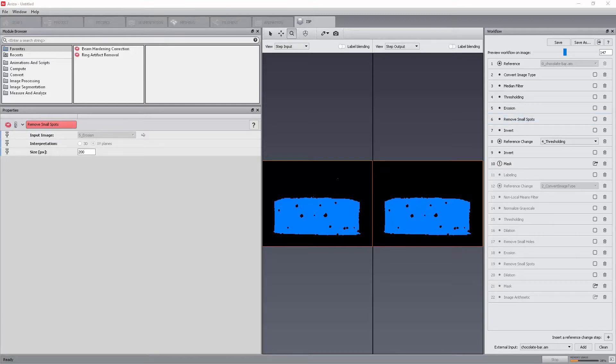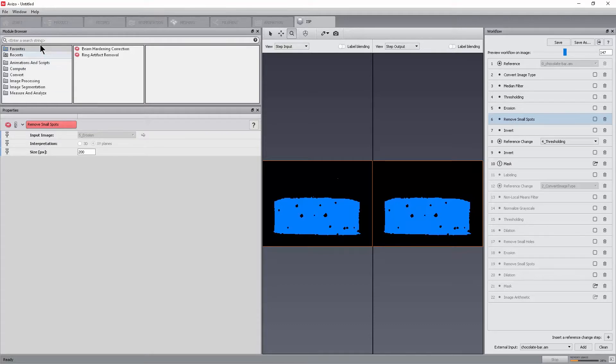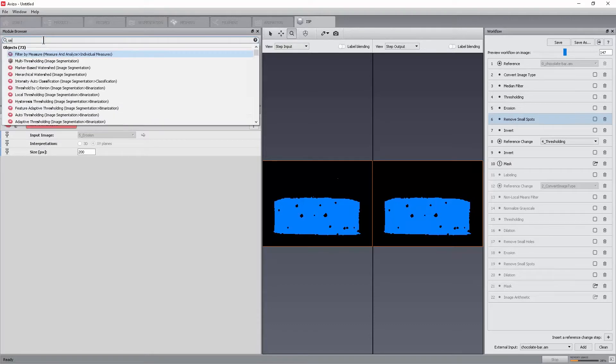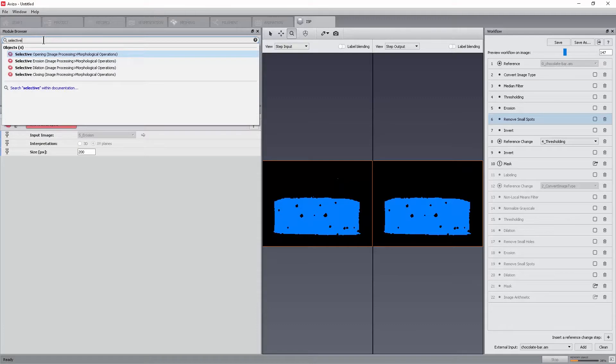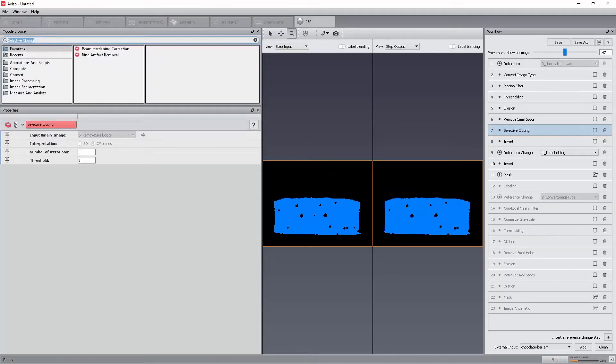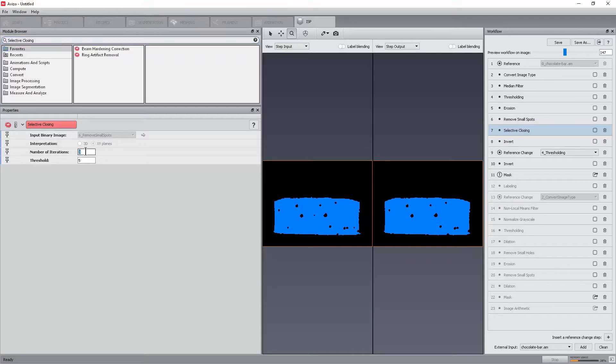The workroom does not delete every step. There is still a chance to fix this by simply re-editing the workflow. Select step 6, remove small spots, and type selective in the quick search toolbar of the module browser. Select selective closing from the list. Set the number of iterations to 5 and threshold to 3.